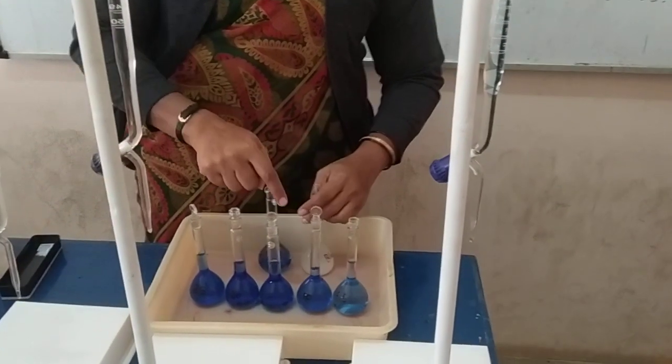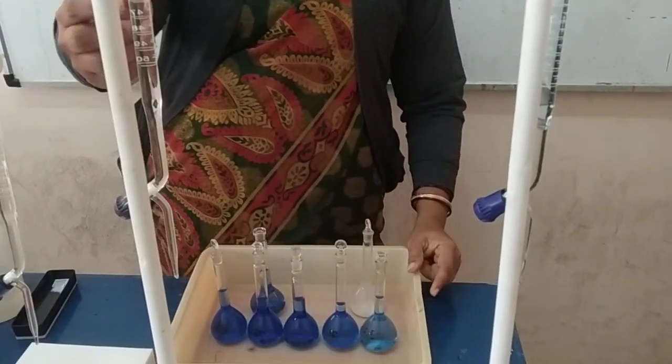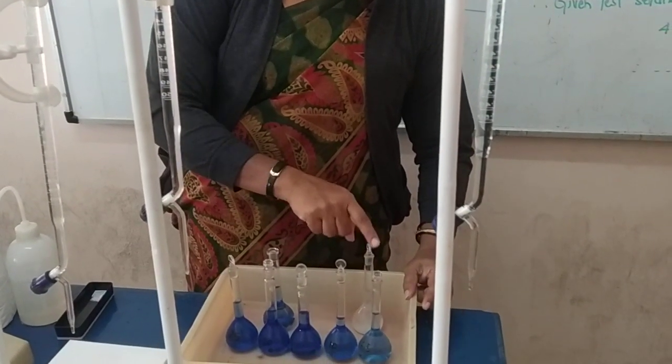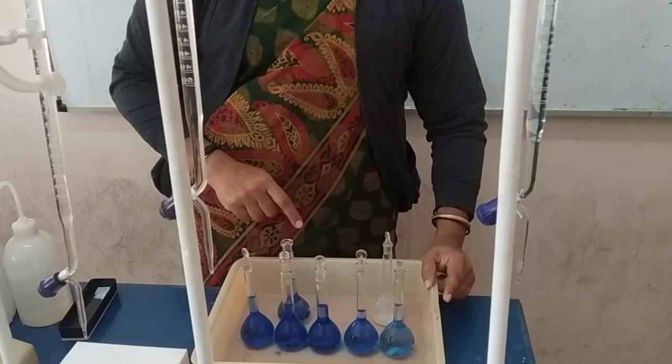Second step: for all 5 flasks — 5, 10, 15, 20, 25 — and also for the blank and the test solution, we have to add 5 ml of ammonia to each and every flask.